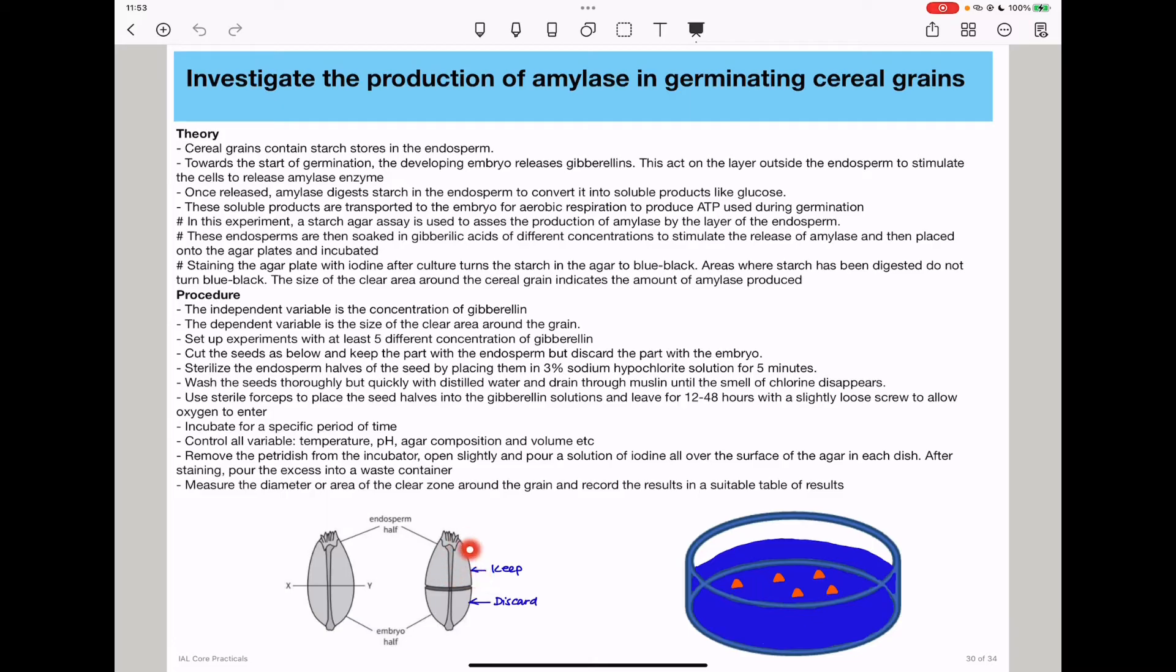Cut the seeds, soak them in gibberellic acid of different concentrations for a specific period of time, then place them onto agar for a specific period. The amylase released from them digests the starch. After incubation, use iodine to see the regions where starch has been digested.